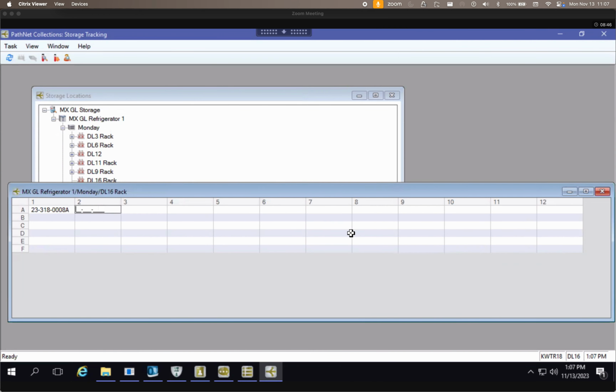And now notice the focus moves to the right. So now we know not only is it filling from left to right, it is also filling from back to front. And it is filling by rows instead of columns. So, does anybody have any questions up through step 8?